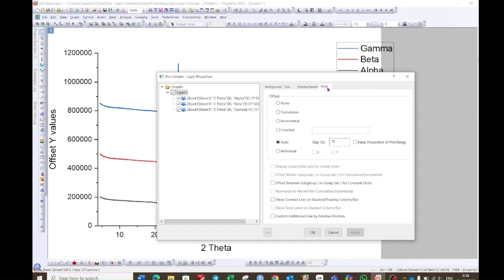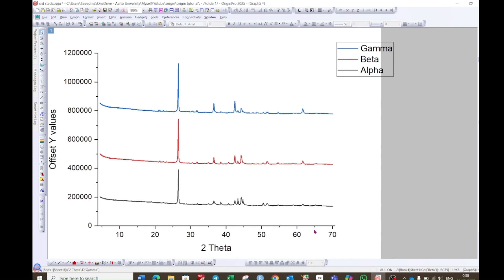Choose the option which says stack. Choose individual, and then make sure this y is selected and then press OK. By doing so, now you can really move the graph up and down.